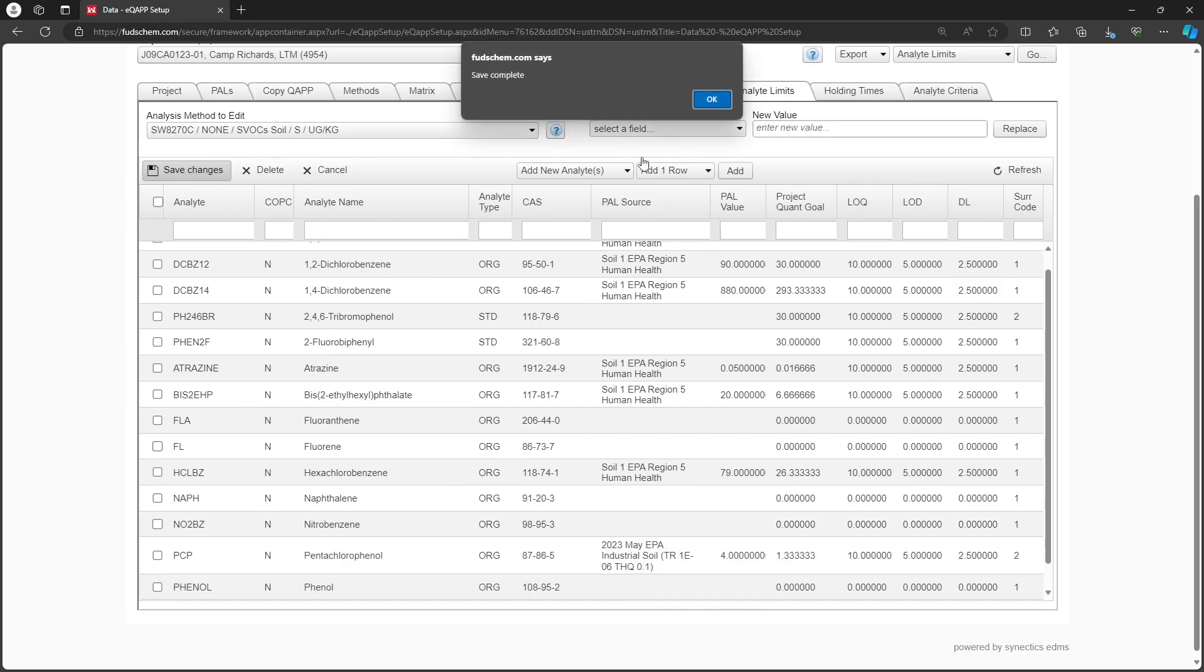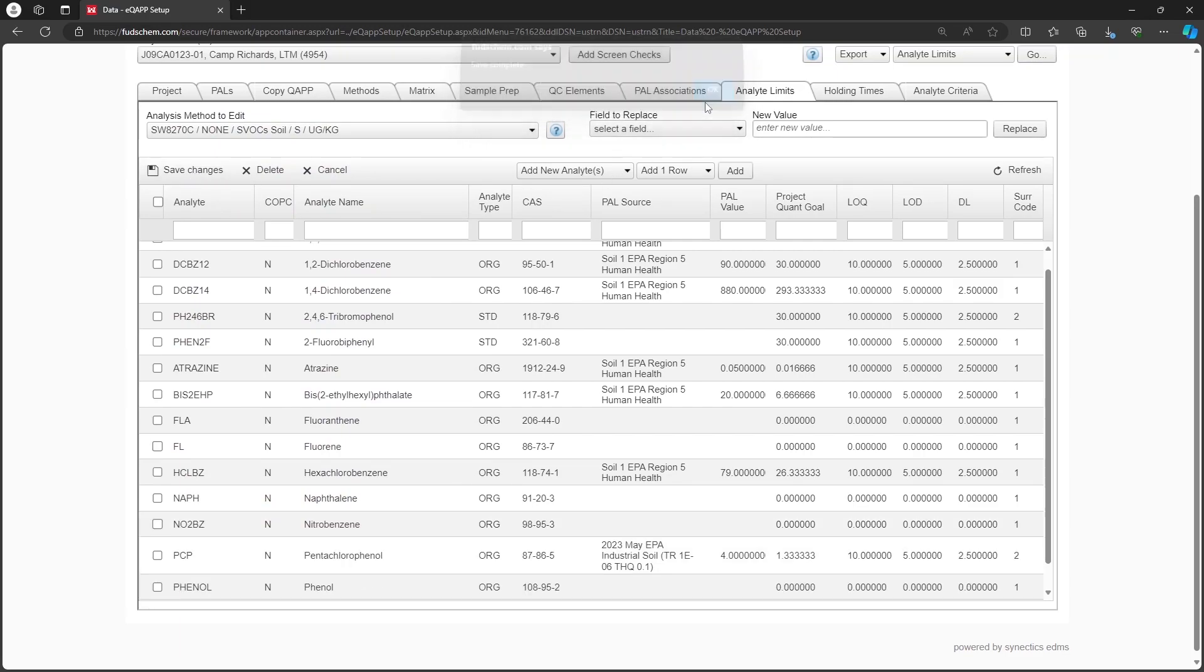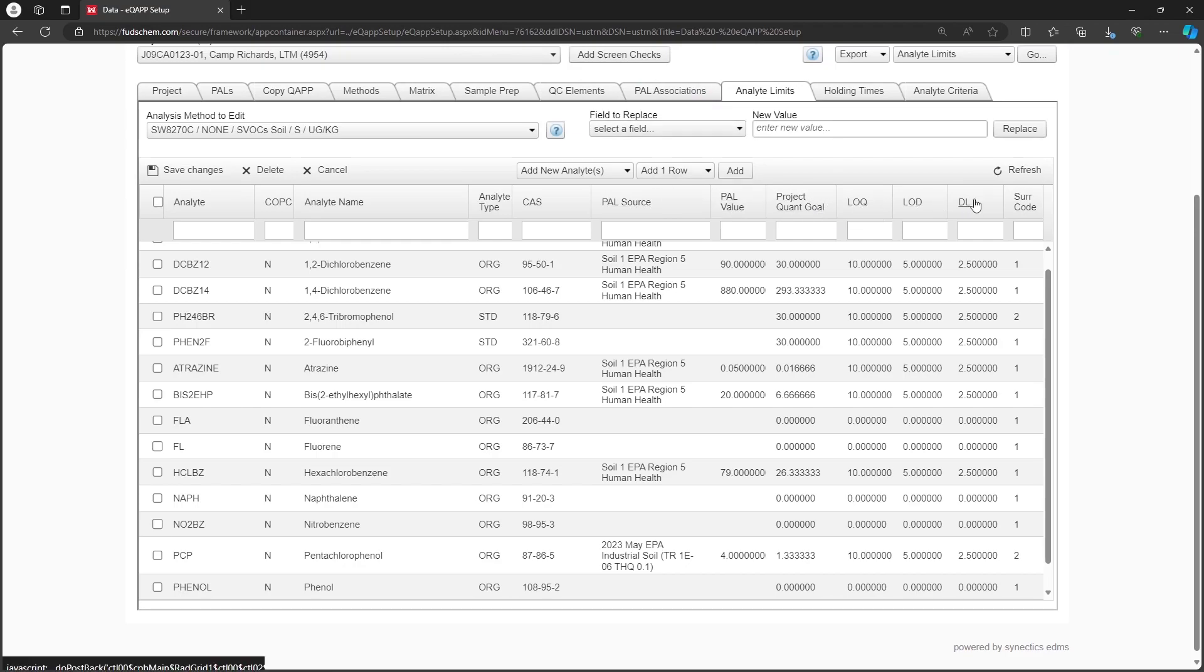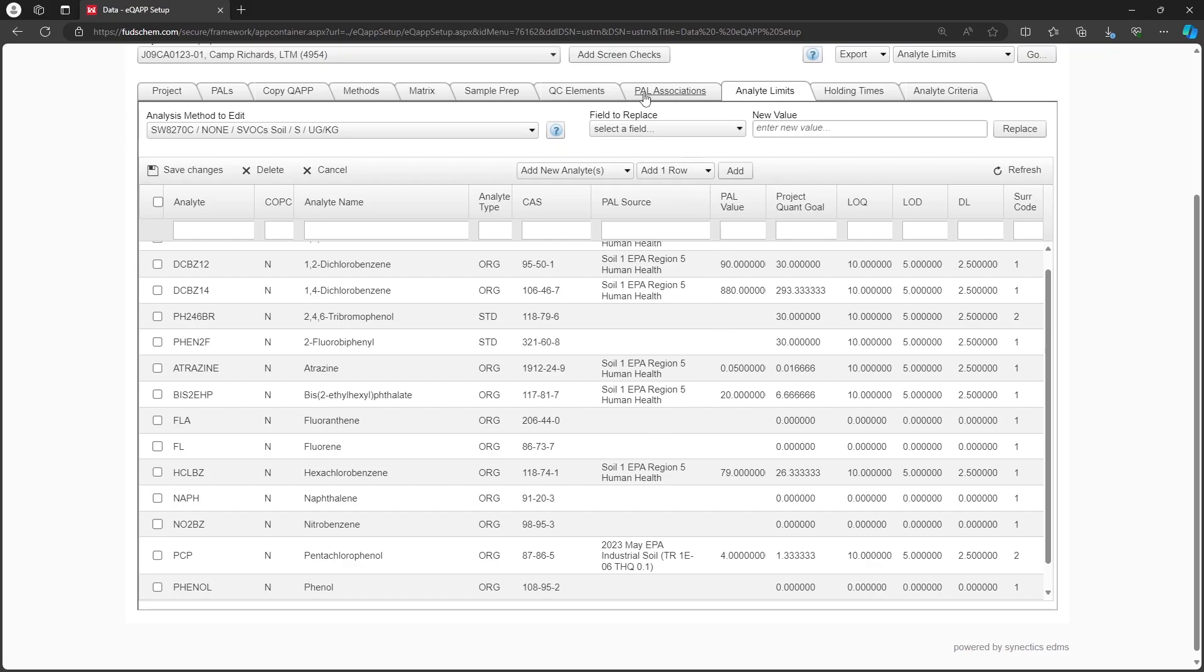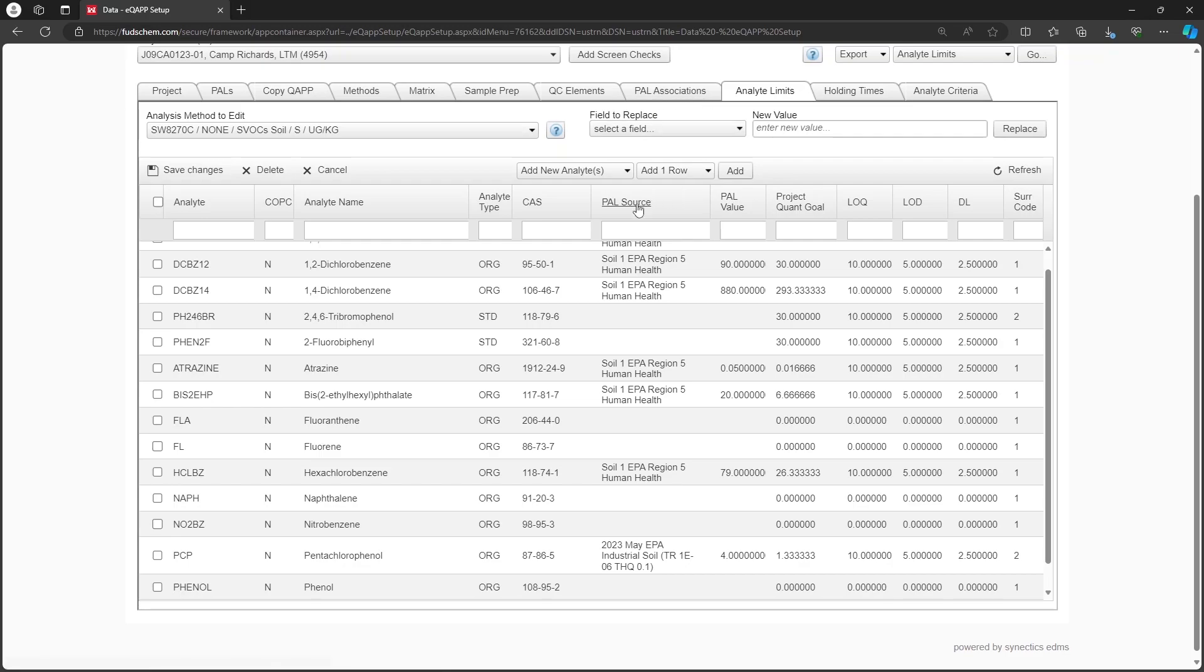We can see that the PAL source, PAL value, project quant goal, and lab limits are all blank for our new records. We will need to fill these out. The PAL source can be set by hand or by reassociating the PAL and method on the PAL Associations tab. Note that doing so will overwrite the PAL source, PAL value, and project quant goal fields for this method.